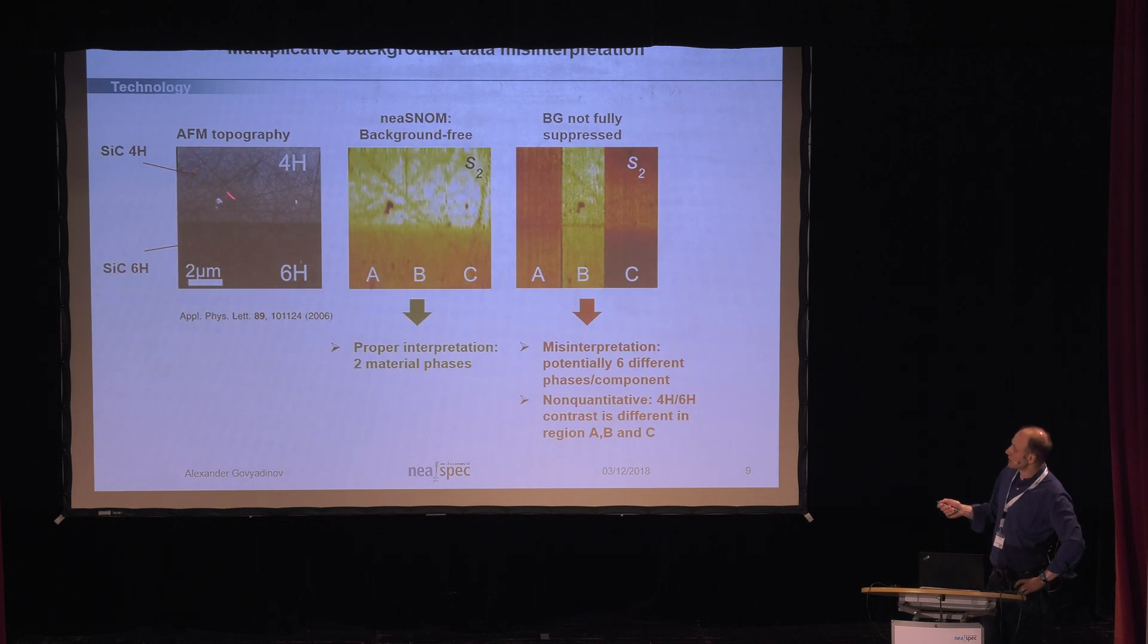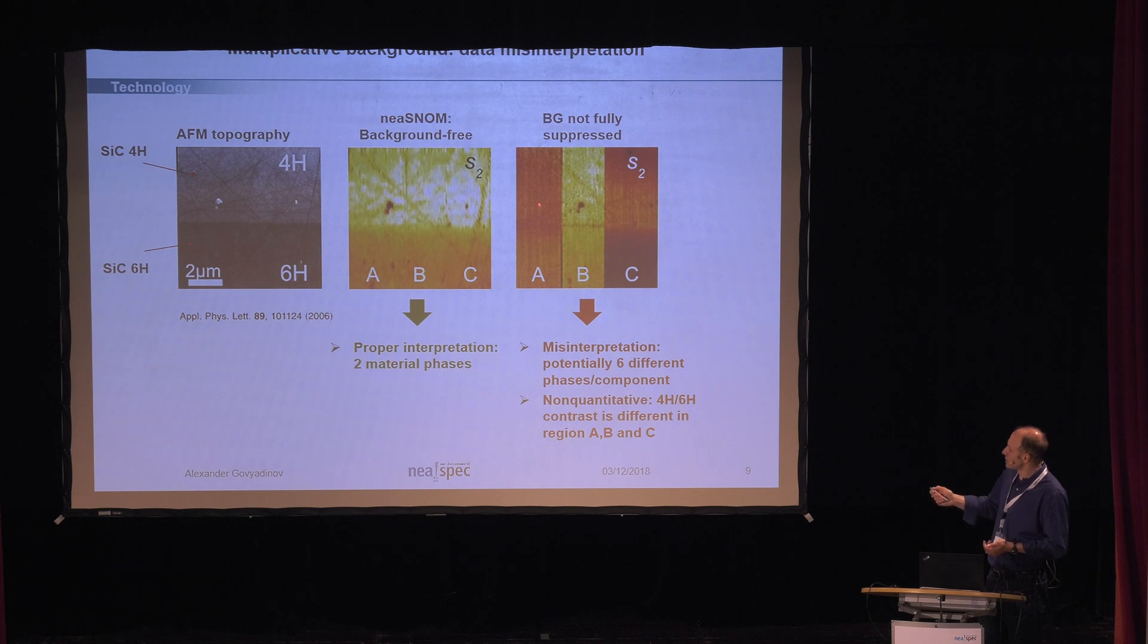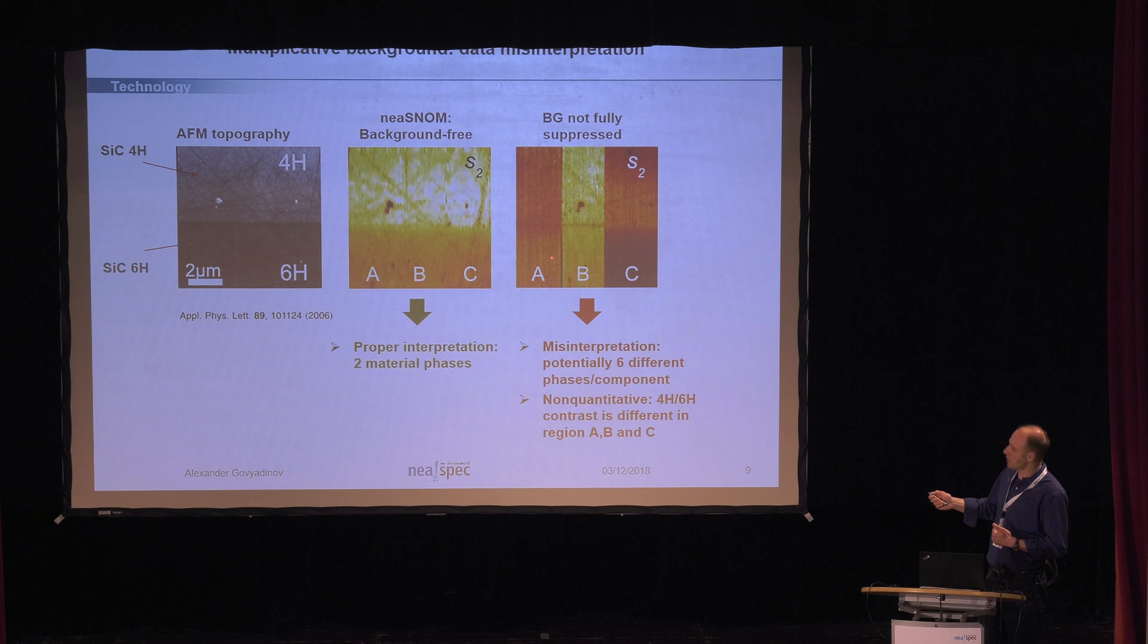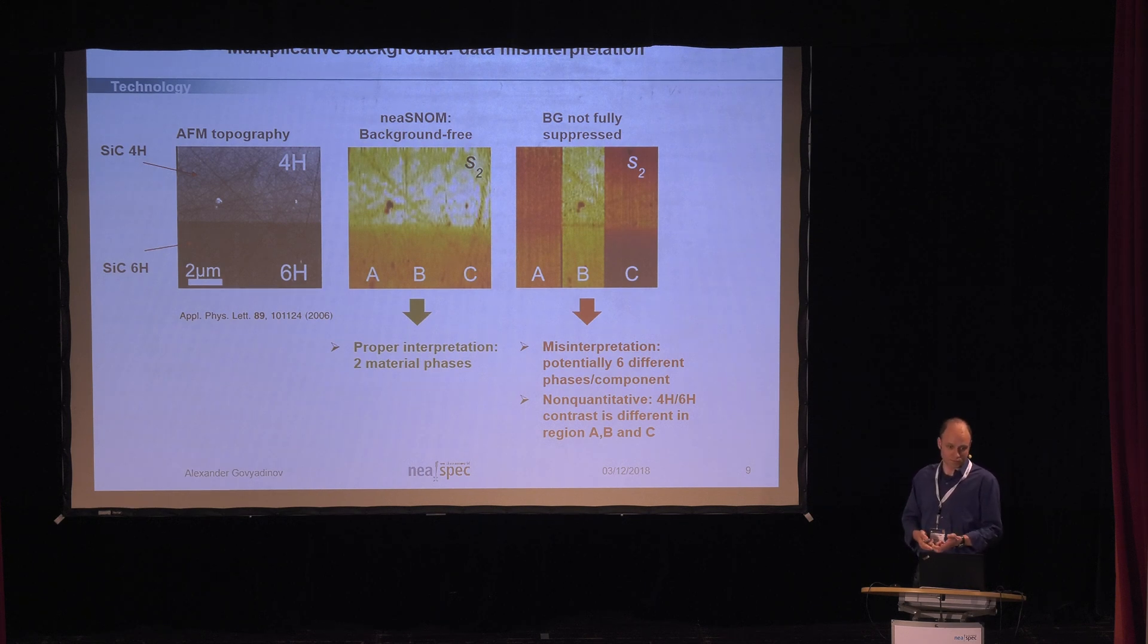Then the second example here. This is a sample which has two crystalline phases of the same material, silicon carbide. You see that there is only two parts. This is the proper image which you should see on this sample. You see the contrast, this one is brighter, this one is a little bit darker. But now, if you don't suppress the background or if you don't use the proper technology, then suddenly you might see something like this. How do you interpret this? Is it six different materials or different phases of the same material? Can you quantify the signal here and here? Because it changes, so the upper part here versus the bottom part here is not the same contrast as here, for instance, or there. So, in other words, suppression of the multiplicative background is very important. It can cause major artifacts in imaging. It can cause essentially misinterpretation or inability to quantify the signal, in other words.